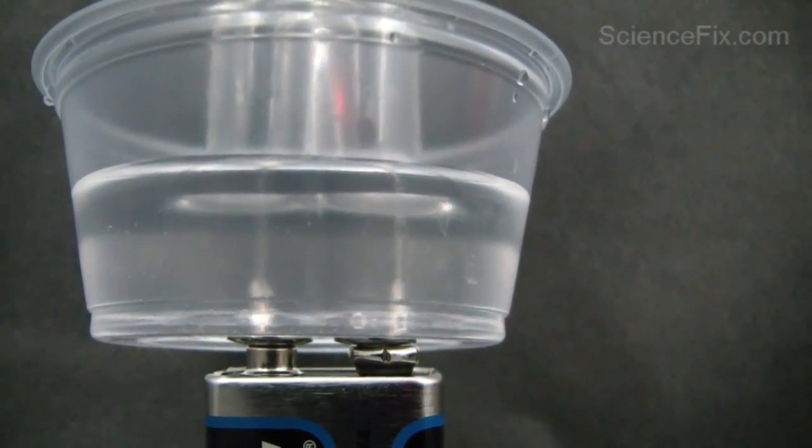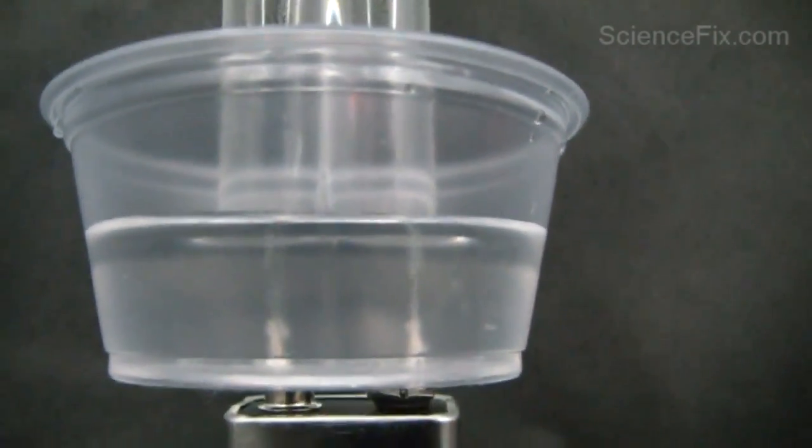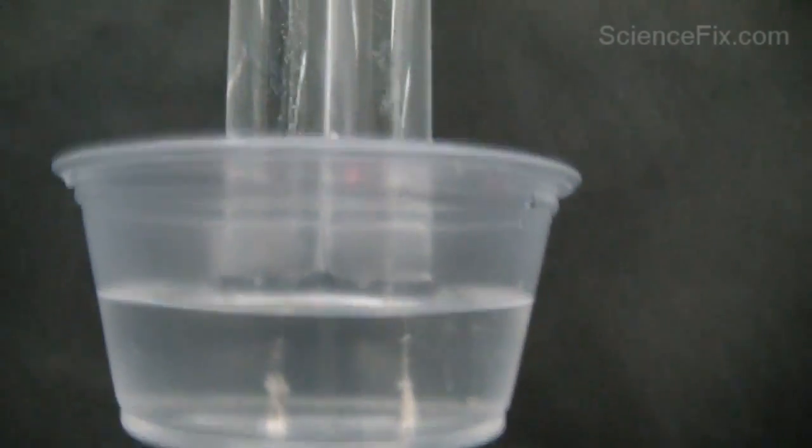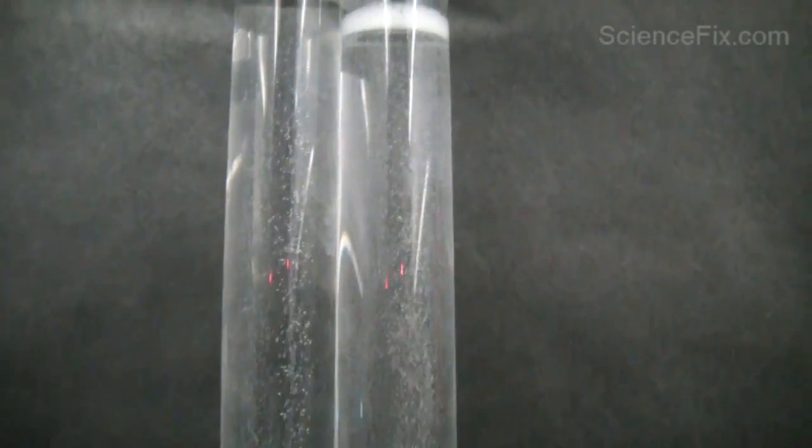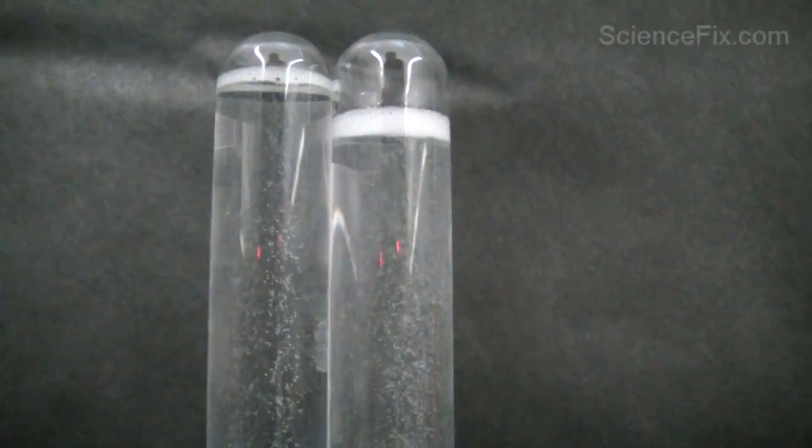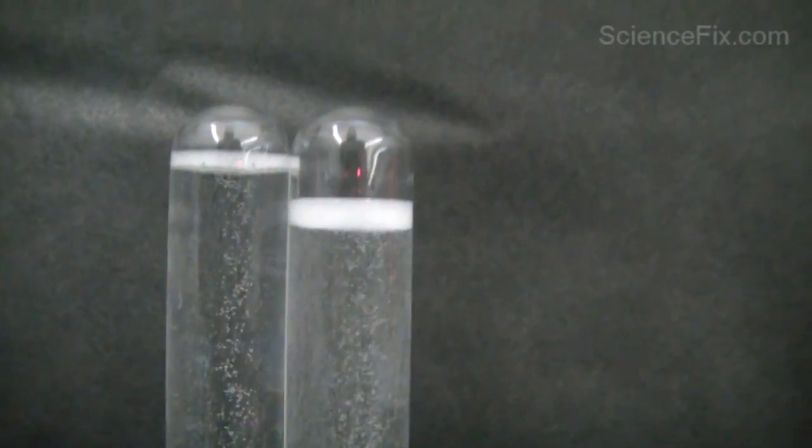Both gases are going to flow up through the test tubes, one gas in each test tube. How do you know which one is which? Well, if you take a look at the amount of gas in each test tube, there's going to be twice as much hydrogen gas as oxygen gas.